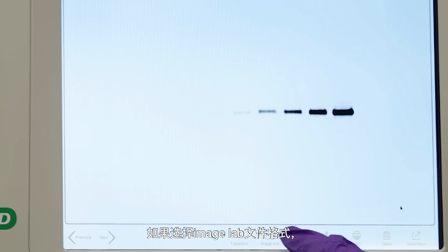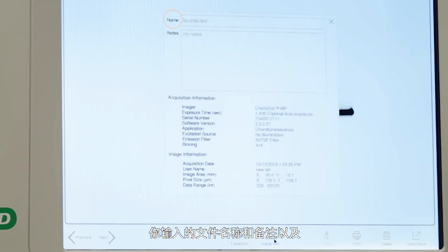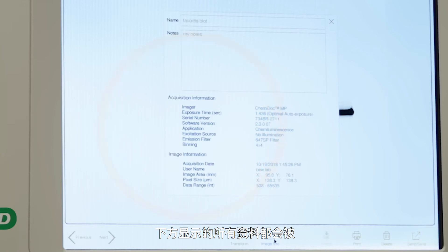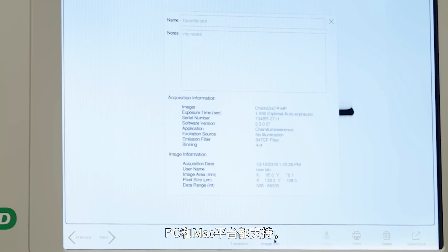If you choose the Image Lab file format, your custom name and notes, as well as all the data indicated, are exported to Bio-Rad's license-free Image Lab analysis software, available for both Mac and PC.